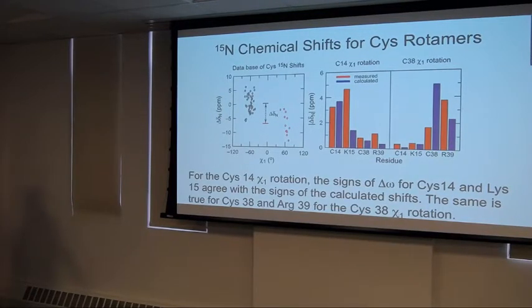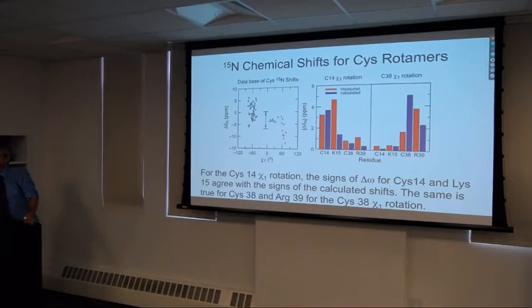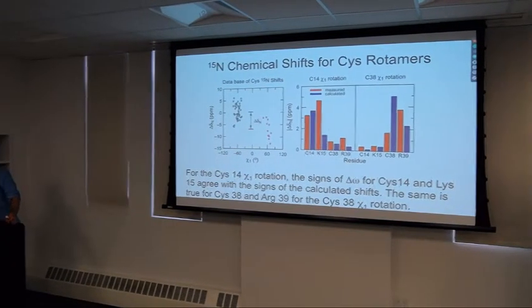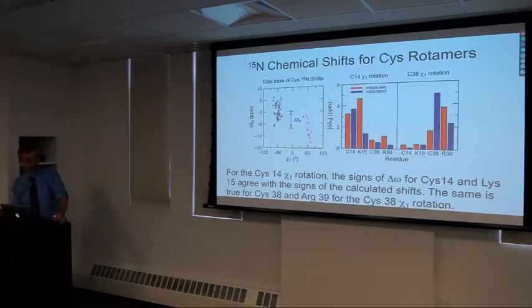Question? Yep? Can that be an easy way to know if there is some kind of exchange involved in this protein? Sure. So that would be one thing one might do in the beginning. Because there are regions of the parameter space where this effect isn't very large, people don't normally do that. The shifts are on the order of 1 or 2 hertz.